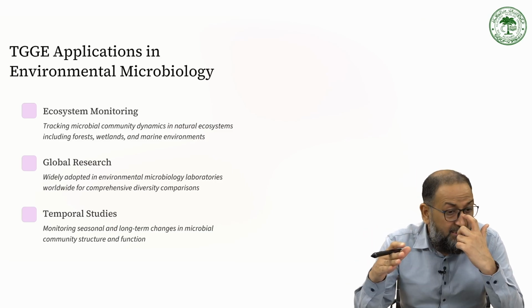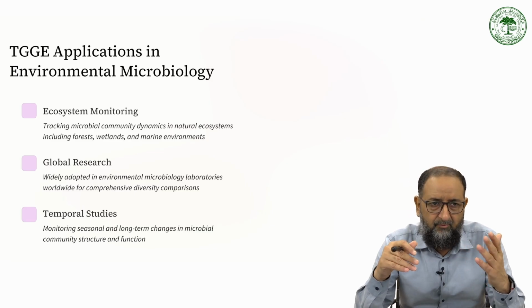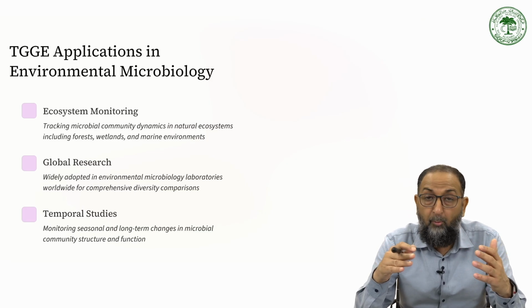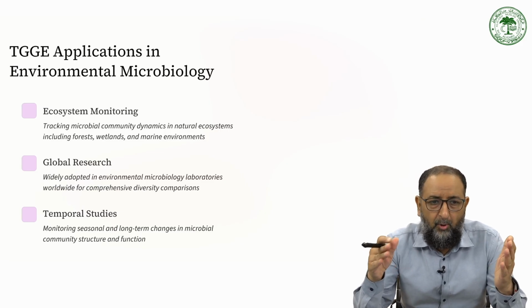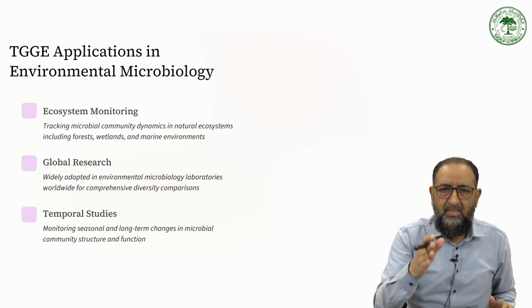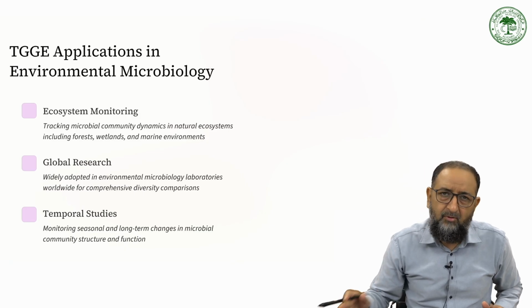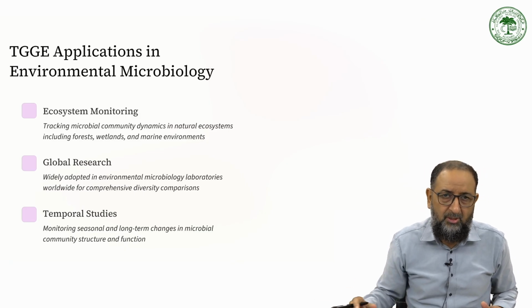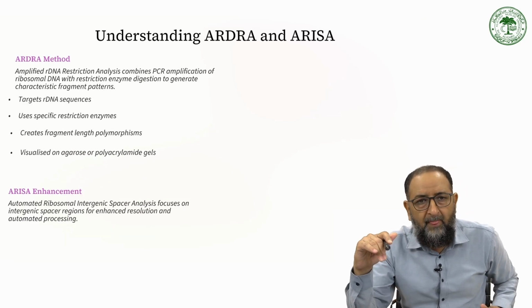When they keep changing, you can identify the changes through these marker methods, DGGE and TGGE. Globally, they are widely adopted in environmental microbiology and ecology laboratories worldwide for comprehensive diversity comparison, where you can differentiate individuals through these methods. They are very commonly used throughout the globe.